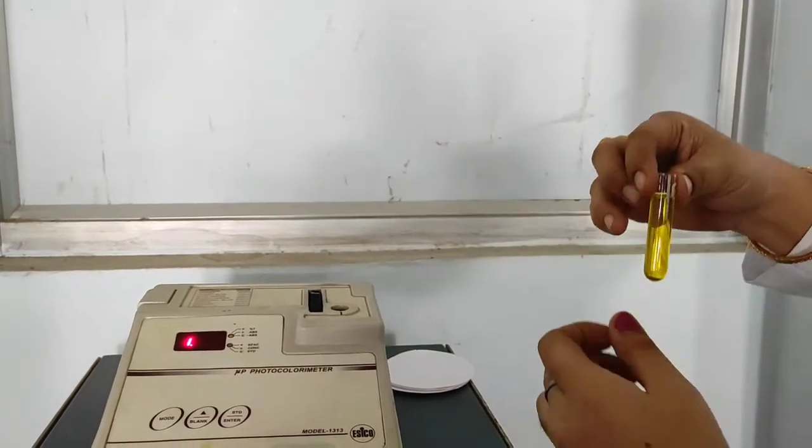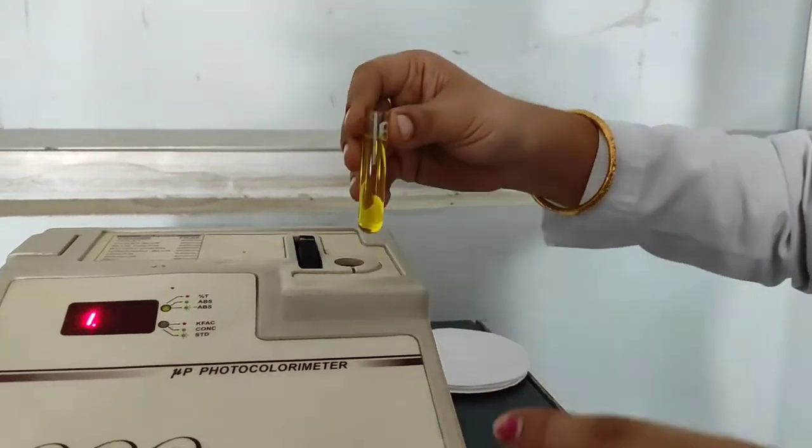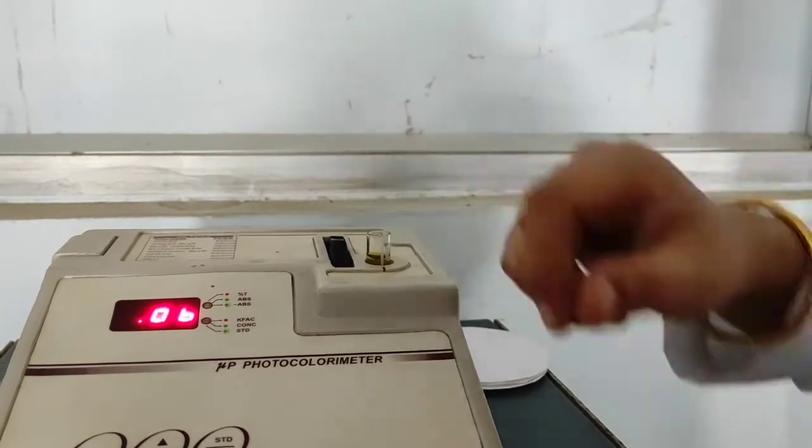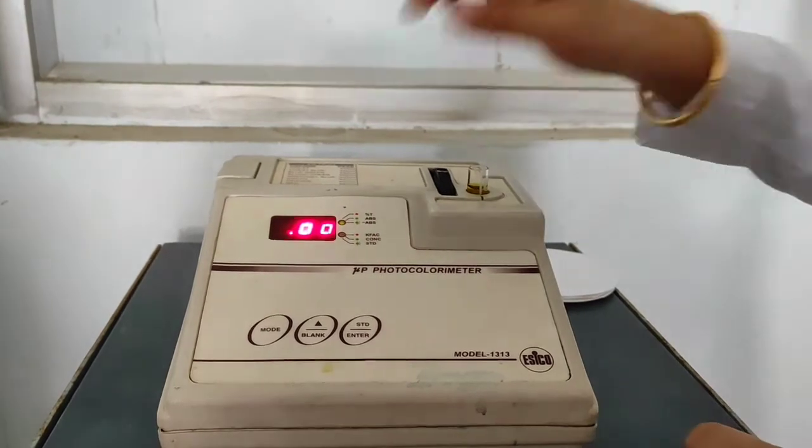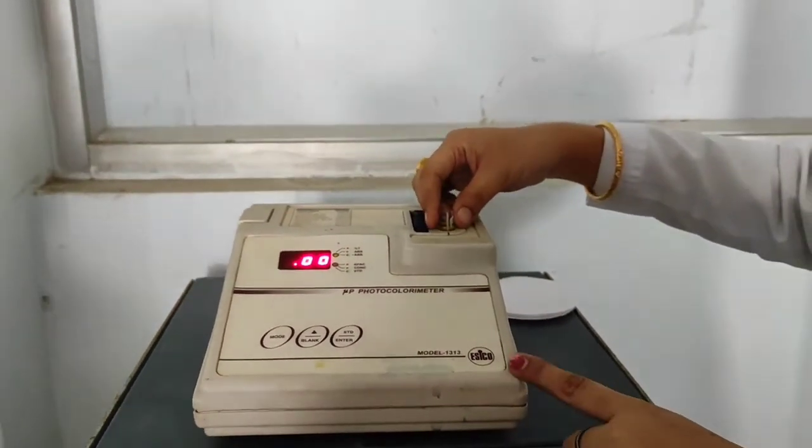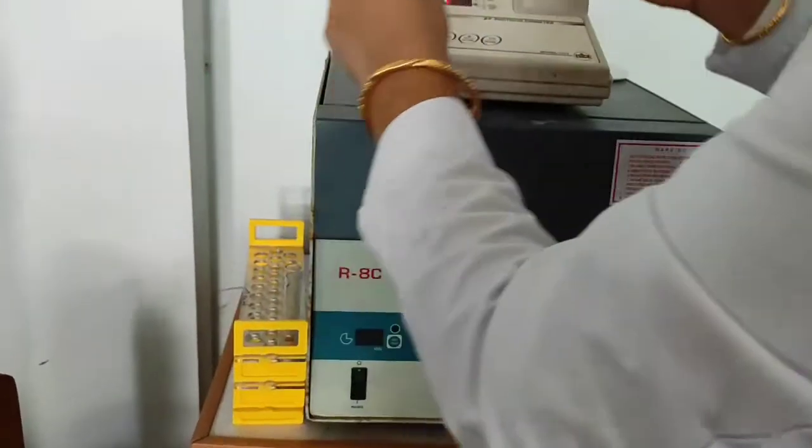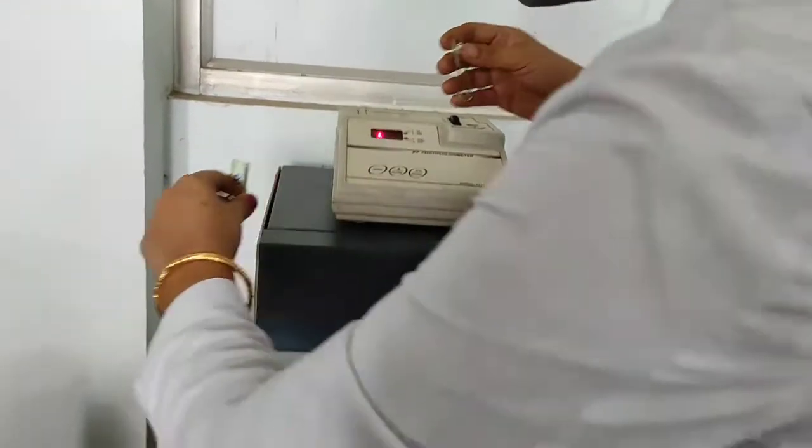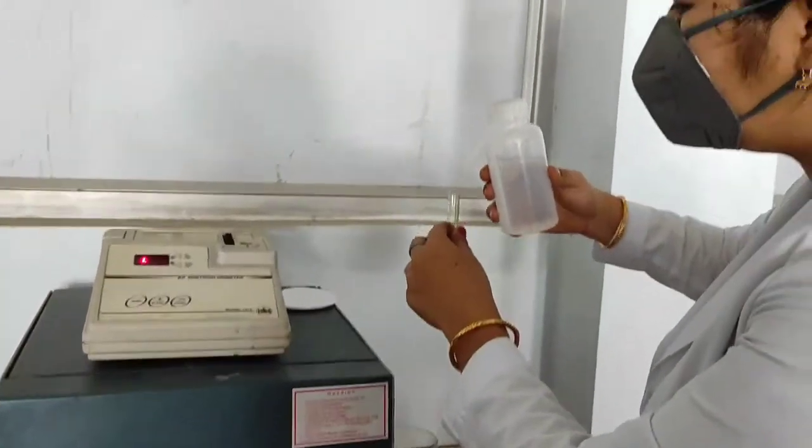So, this white mark, it has to be aligned with the notch here. So let's place this, then I have to press for the blank, so 0.00, this is optical density of the blank, and then, I'll wash it with distilled water.